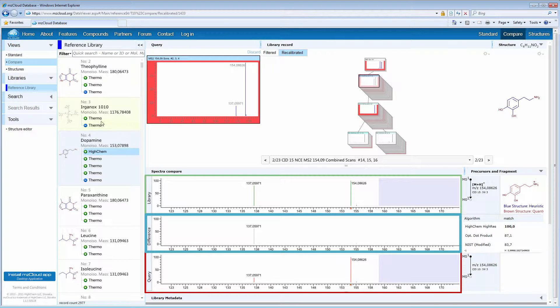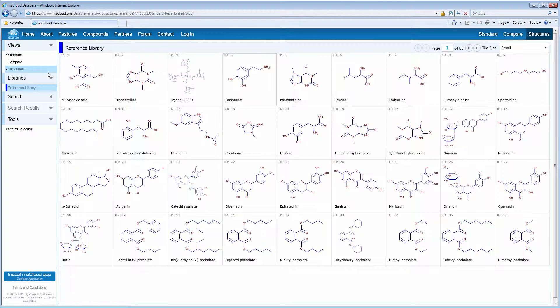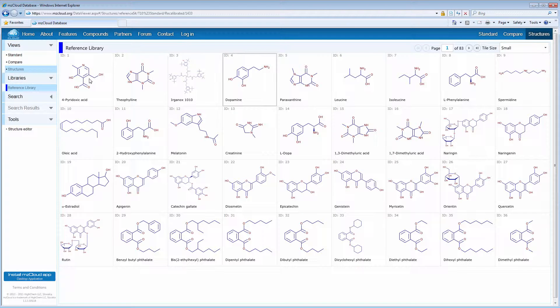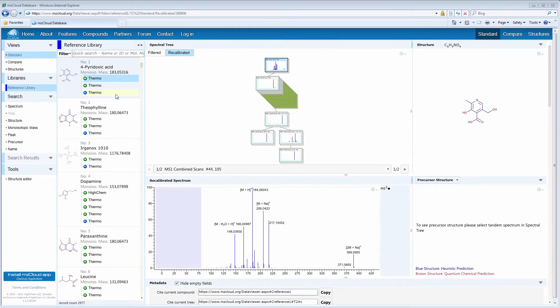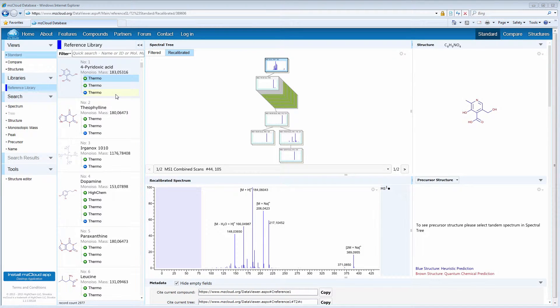You can also choose Structure View. Structure View displays chemical structures of multiple records, and if you double-click on a particular structure, it will direct you to the specific record in Standard View, showing the spectral tree, structure, and active spectrum.